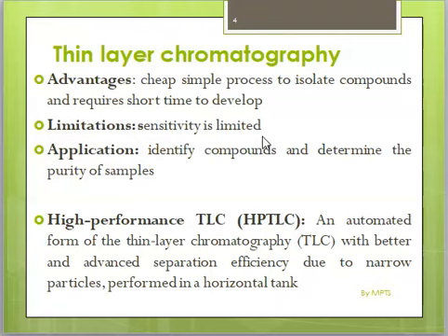It is cheap, but of course the sensitivity is limited. It can be used to identify compounds and determine purity. Of course, everything's reference is in the pharmacopoeias. However, we have high performance TLC, which is usually automated, and it ensures better separation. The difference is that here the separation occurs in a horizontal tank, and the TLC occurs in a beaker, or in a beaker which is covered.